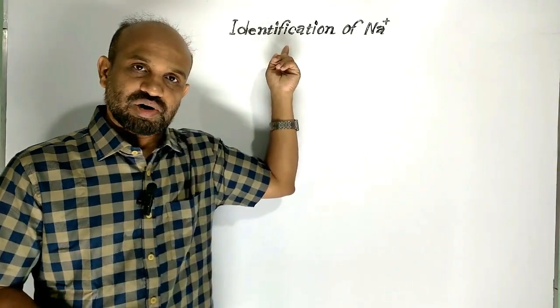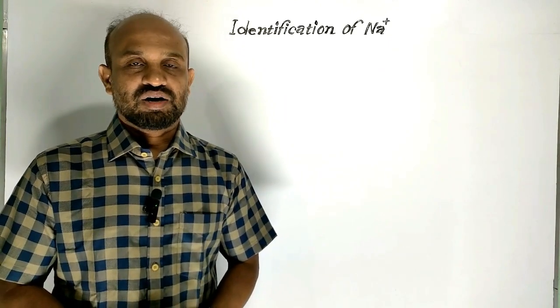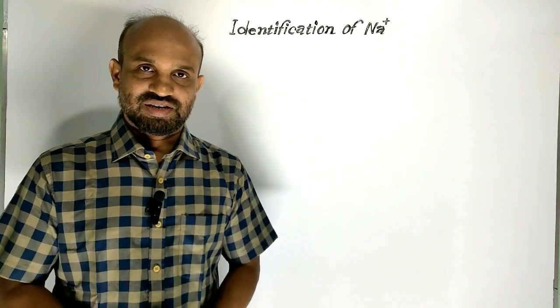Identification of sodium ion. This is today's lesson. In this lesson, we are going to learn how to identify sodium ion in its solution. So, let's begin.